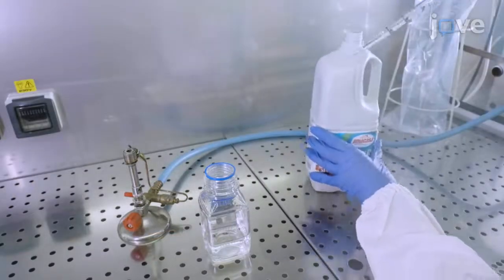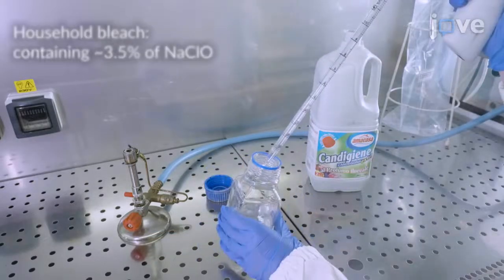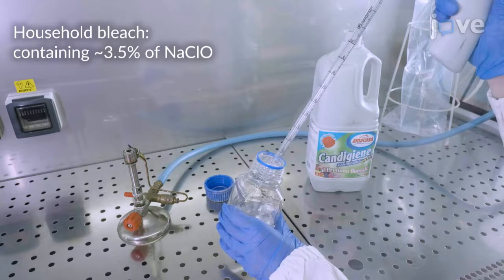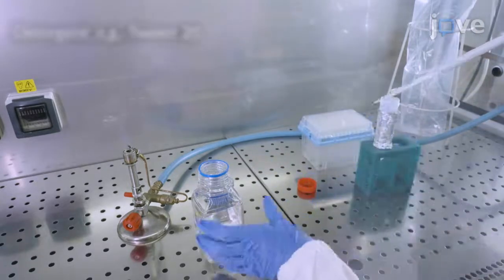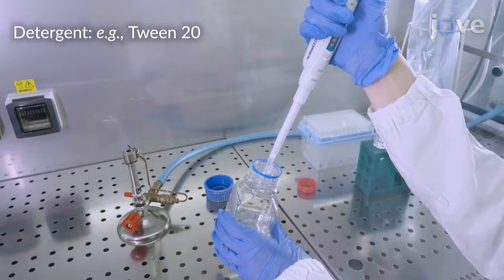Next, prepare a 5% bleach solution by adding 5 ml of household bleach to 95 ml of sterile distilled water. Then, add a few drops of non-ionic detergent to the bleach solution and mix thoroughly.